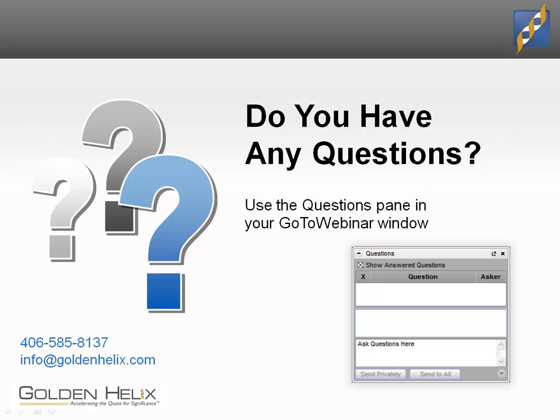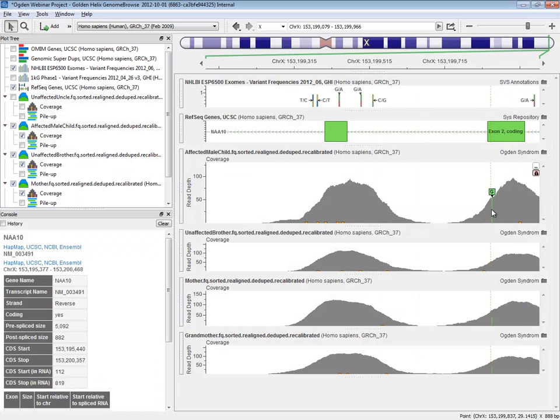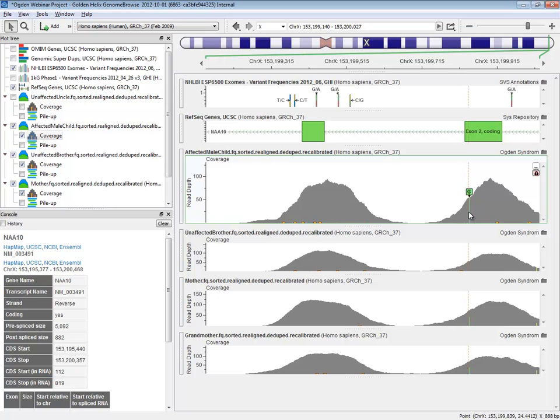maybe, but at the end of the day, it's really about what you're trying to accomplish in your analysis, or really what the experiment calls for from an assay solution. If you're talking about rare, highly penetrant variants in coding regions of genes, heck, exomes these days are cheap. They're extremely high coverage. I have my own exome from 23andMe that I've presented on before and will do again. I have every confidence that if I were to look at a variant that looked as good as this one in Genome Browse, there's no reason I would ever doubt that it exists biologically in my DNA.